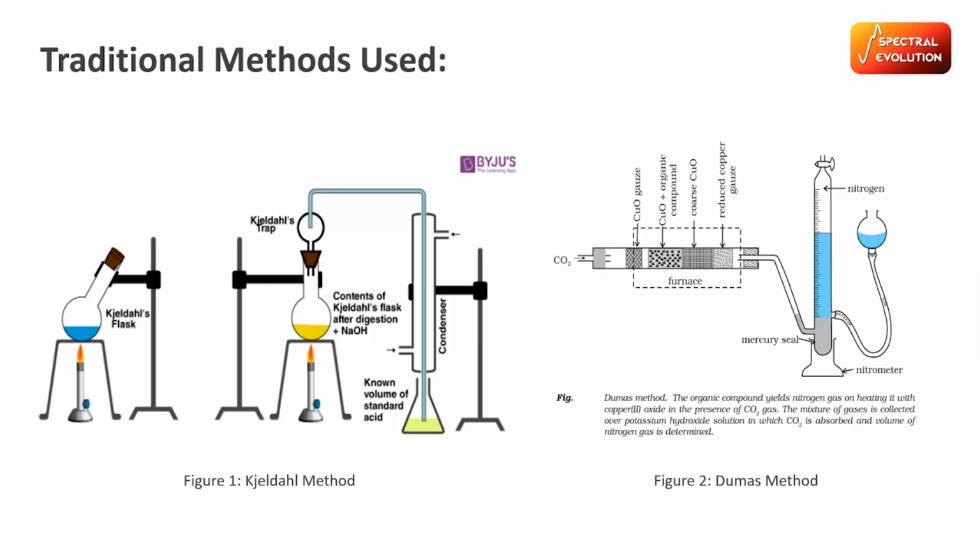So there's a few different methods for the lab-based nitrogen quantification. The Kjeldahl method, a traditional laboratory technique, measures total nitrogen by digesting the sample in acid and converting nitrogen compounds into ammonia. This is accurate, but time-consuming and requires a chemical procedure in a lab. And then there's the Dumas method, which is also very common, which is a faster combustion-based technique that measures nitrogen gas released when a sample is burned. Also very highly accurate, but it still needs lab instruments and controlled conditions.